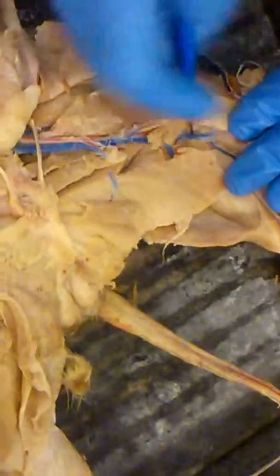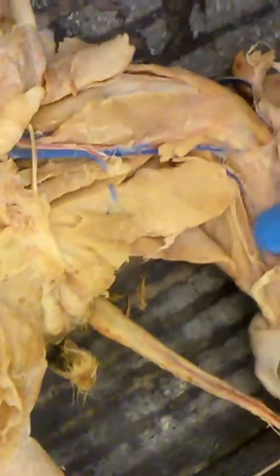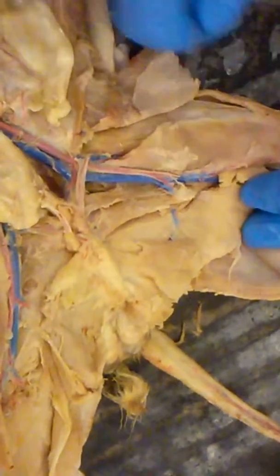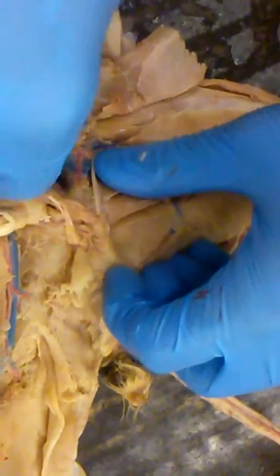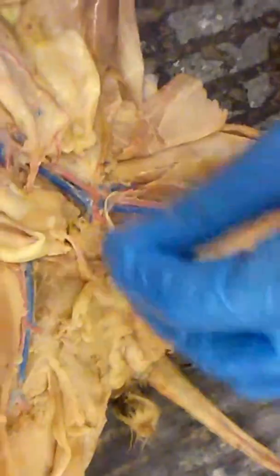And you do have to know popliteal vein? Yes. So that would be right there, behind the knee. That's the giveaway for the area of the external iliac again. That's what you're supposed to be following. Just think about where it is. I believe it's right here, but it turns into the femoral. And then fairly quickly, popliteal. And then the internal one you said was the one that looks like it's going to go to the tail. Yeah, I believe it's that right there. That's your basic idea.